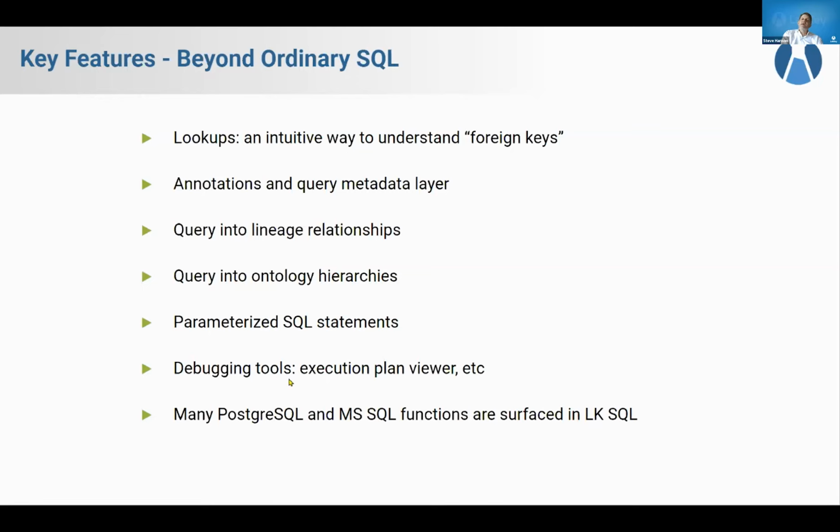There's also a very powerful annotation layer and query metadata layer. These are like properties or annotations that you can layer onto your queries. We already saw a little hint of it earlier when one of the values was displaying in red. I forget, it was one of the temperature values, and that's because I layered some metadata onto my query. I layered on a rule that said, if you have a value that's over 37 Celsius, I want to see it in red. This whole feature set is really quite extensive. And if you know LabKey SQL and you know a little bit about query metadata, you can really go very far.